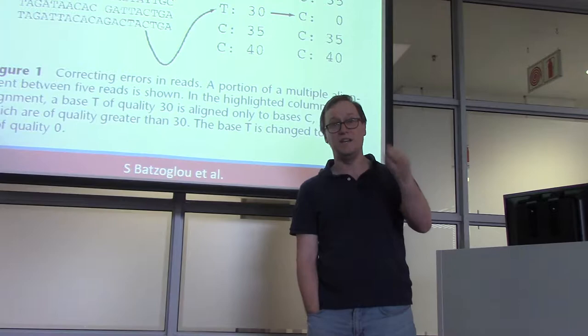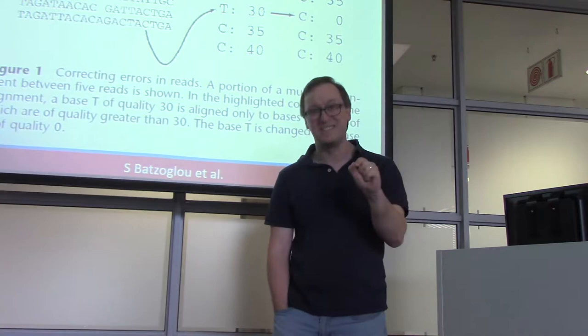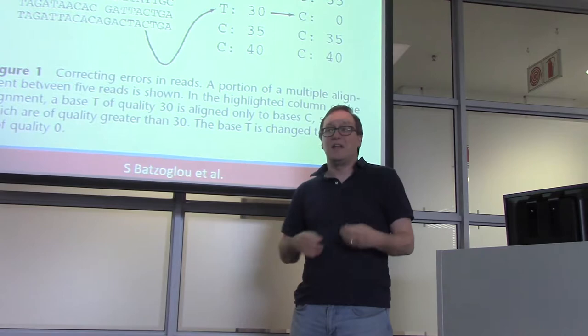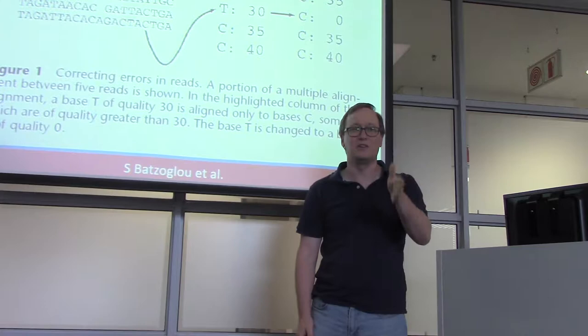Okay? So you might think, 1 in 1,000, that's vanishingly small. This thing's got to be right. But I want to point out that millions and millions of sequences were output by the sequencer. And the chance that any one letter could be wrong in that pile must account for the fact that there are lots and lots of such sequences. So occasionally, you're going to see that you have a very high PHRED score, a very low probability of error, associated with a single base call, and it's just wrong. It's just wrong, even though it might seem statistically very unlikely.